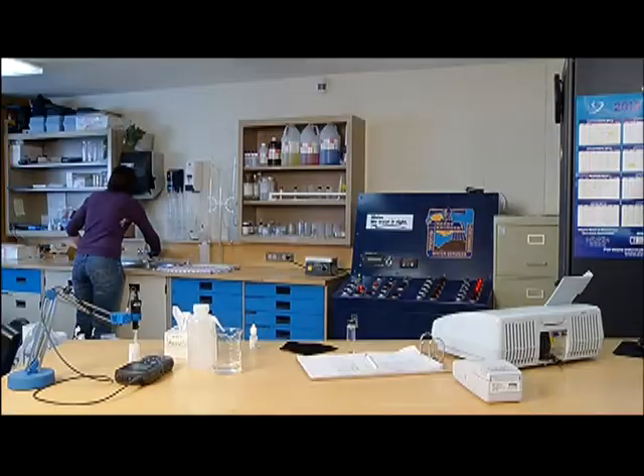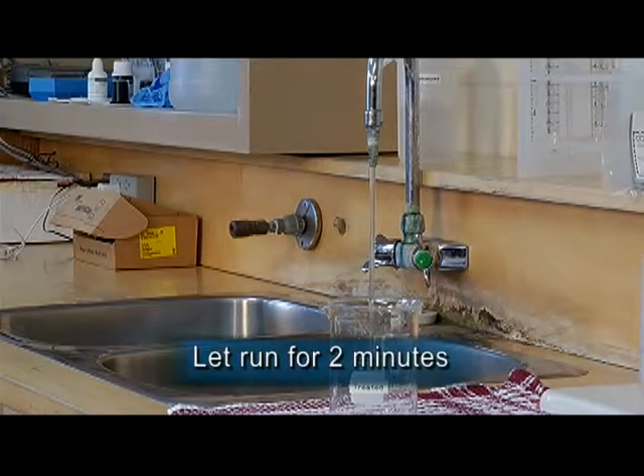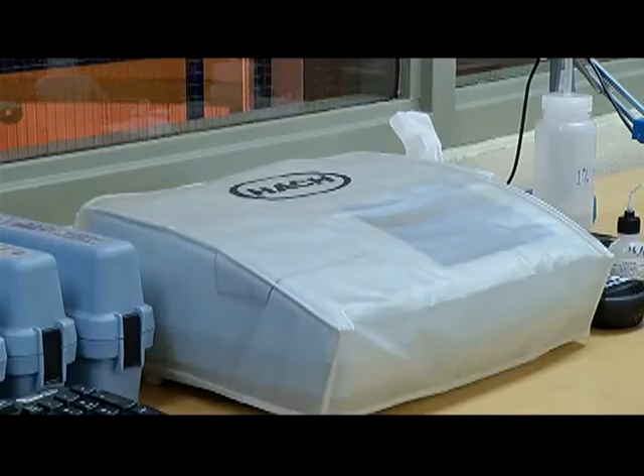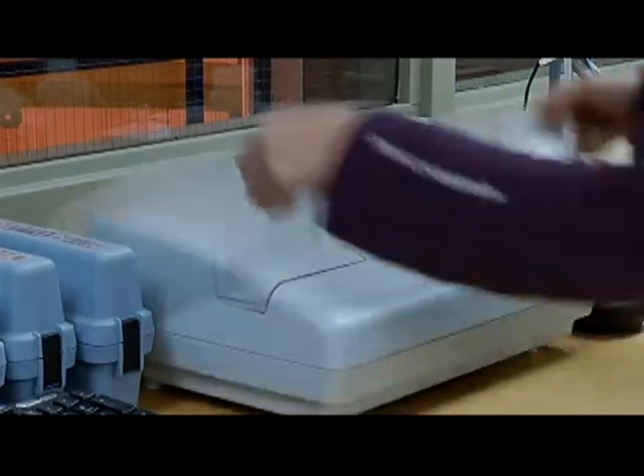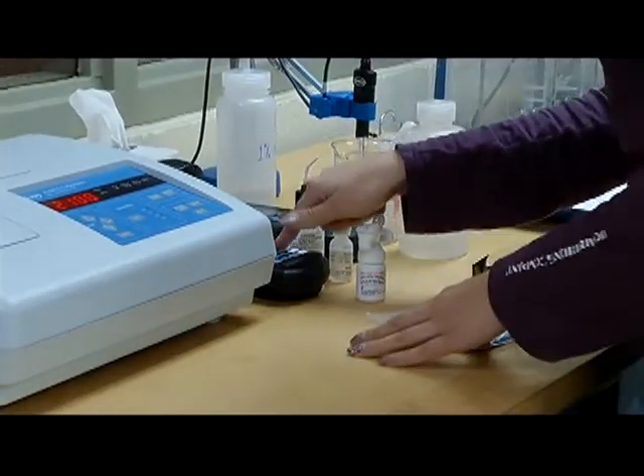In obtaining a representative grab sample for turbidity, plan ahead and run the tap for a minimum of two minutes so standing water clears the plumbing. While water is flushed through the sample tap, this time can be used to prepare the tools and supplies you'll need to conduct the test.